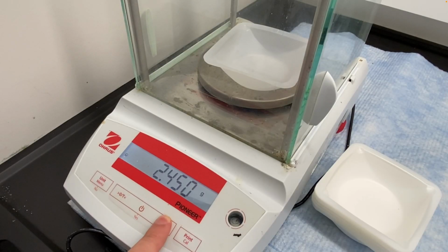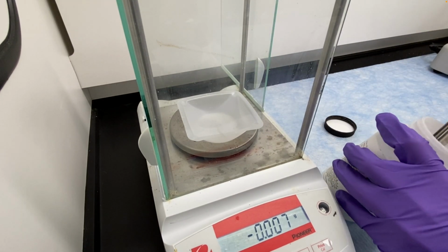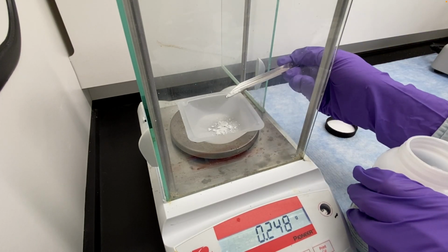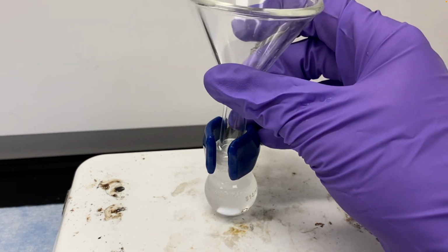The procedure is the same. Anytime you add a solid, put a weighing boat on the balance, tare the balance, and then make sure you have a clean spatula and add that to the weighing boat. Notice how I'm not just dumping that over, but I'm holding it above and shaking it so that I can get a more precise mass. It's almost impossible to get the exact mass that is recommended in a procedure. So the important thing is to get close, and then to make sure you keep a good record of exactly how much you've added. And then if something goes wrong in the experiment, you can always look back at that record to see if maybe that was the cause.